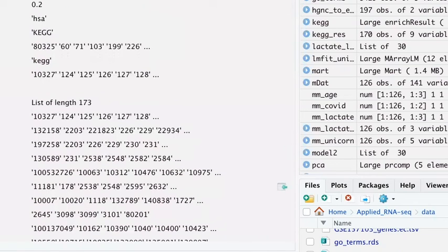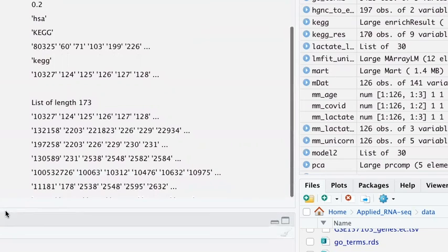So there you would use the dollar symbol after the line that Nikita has. Exactly, because that's a list. But KEGG is an S4 object. So you're isolating a list from the larger object with the @, and if you want something out of the list, you do the opposite.